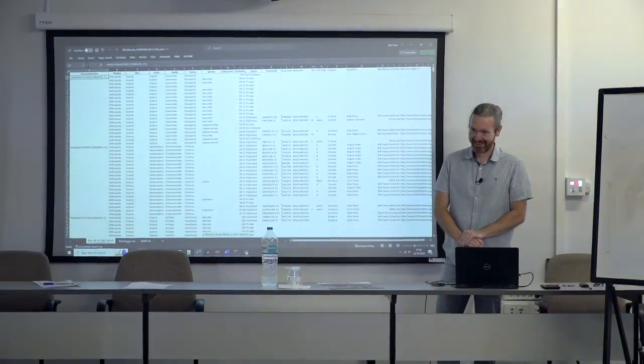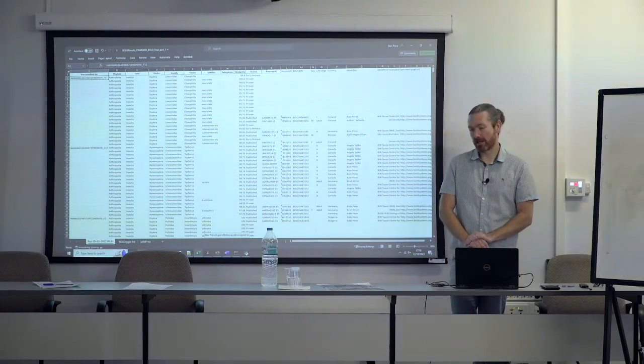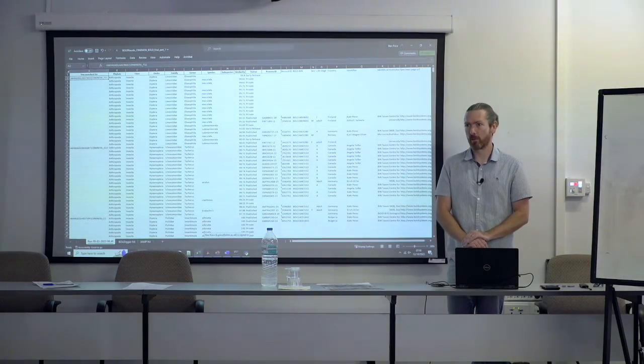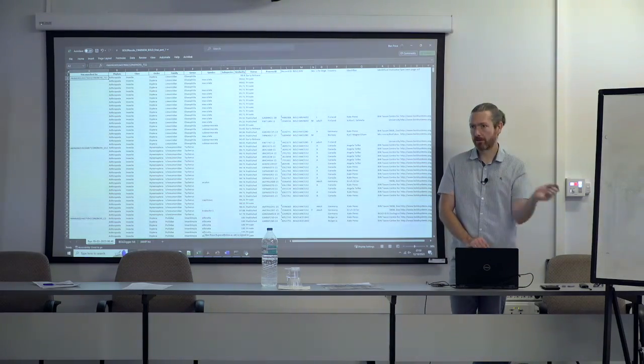Yes. Flag it. So there is a flagging system in Bold where you can tag things, and it's something we'll be using for the reference library curation work we're going to do, where we're going to flag probably thousands of records as removed from bin or needs manual curation or something along those lines. And that is something you can also do. If you have a login to Bold, you can just go and flag records.